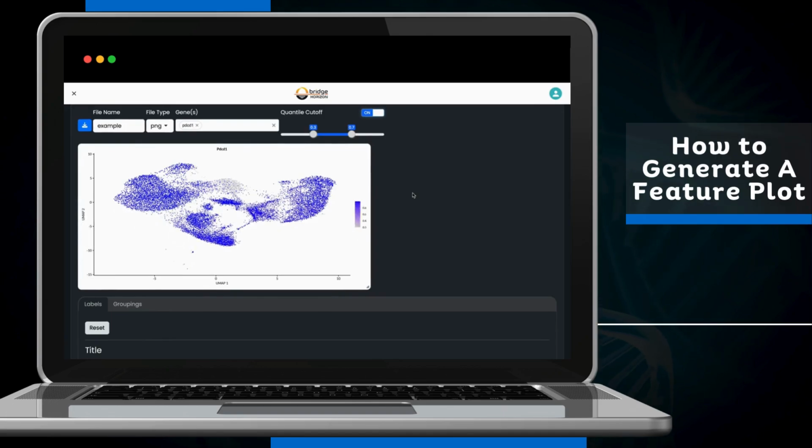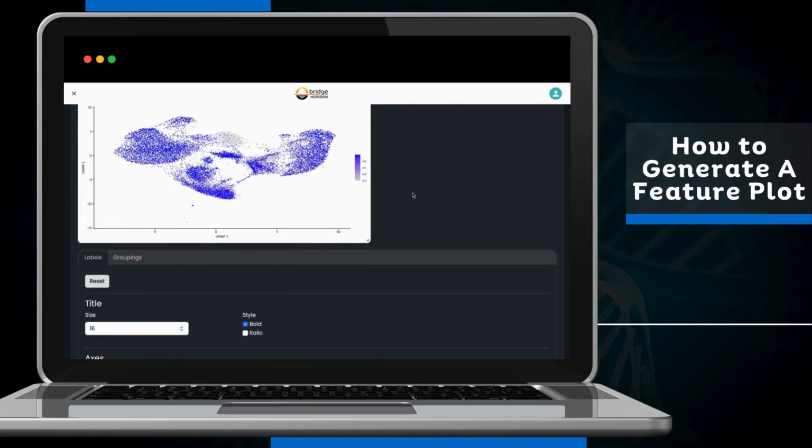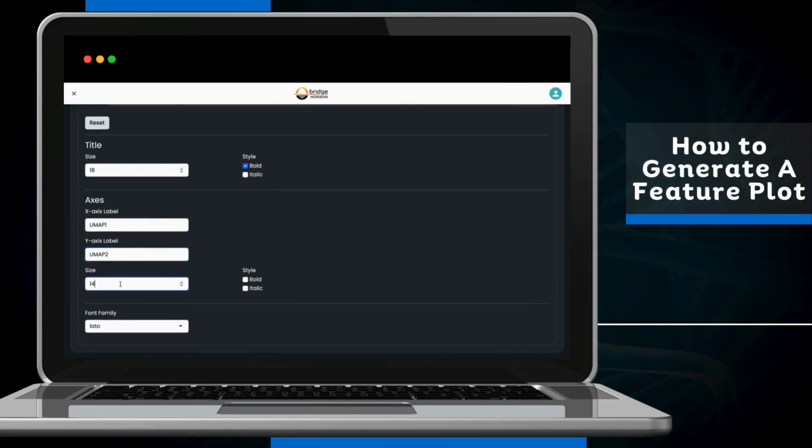In a similar fashion to the violin and the UMAP plot, you can also change some of the main configurations for this plot, such as the size of your main title, your X and Y axis labels, the size of your X and Y axis labels, the styling, as well as the font family.